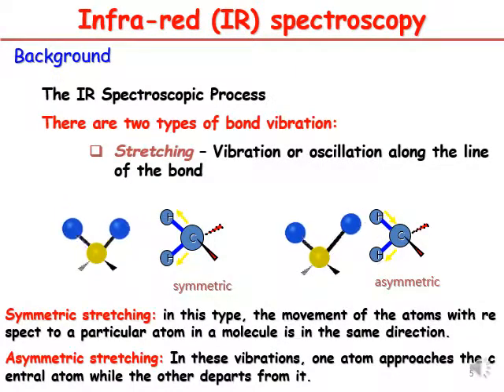So this is what we call the motion. You can see they are stretching, and this stretching is a vibration or oscillation along the line of the bond.